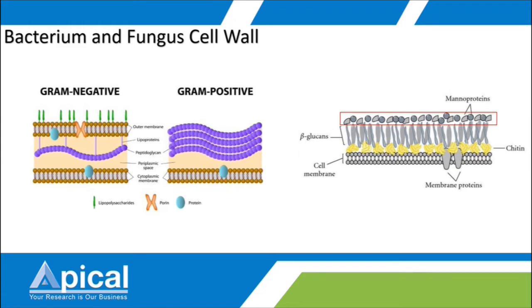All these layers make the fungus cell difficult to break.